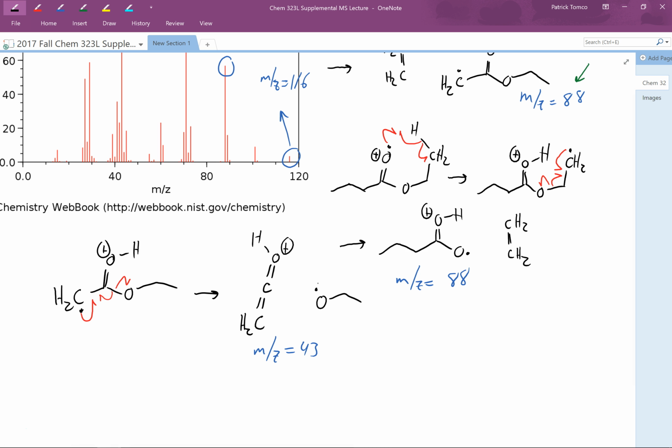So this is a pretty good primer for the types of reactions that you're going to experience when you collect your data. Oftentimes it's difficult to interpret this, but if you follow these general rules, it should give you a good starting point. Any further more advanced interpretation of the spectra is probably best to check with your instructor about and be in touch with them as you go along. So good luck in interpreting your spectra. I hope that this was helpful.